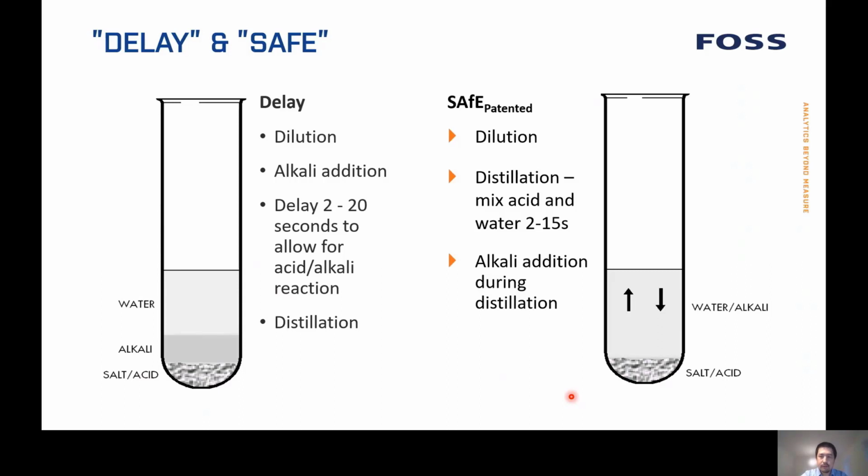It's not that strong, so there will not be a very strong reaction in the digestion tube, which avoids some problems. Also, you can use special applications that need very concentrated acid for the distillation. With this steam procedure, dilution comes first and dilutes the strong acid inside the digestion tube, which will be safe for the operator.